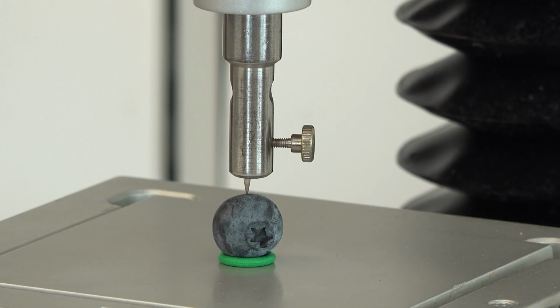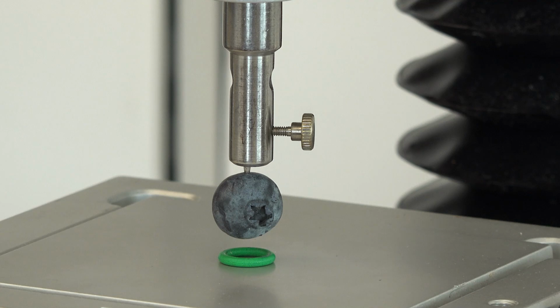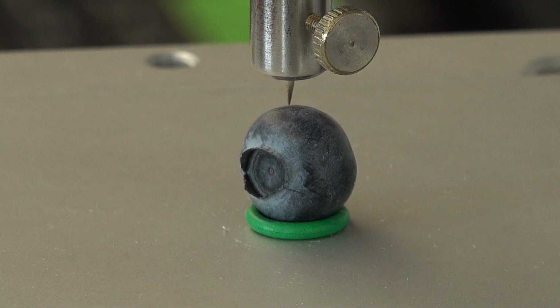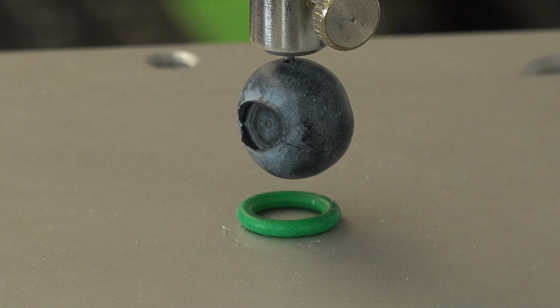And from this method, you can get parameters like hardness or resilience. We've also been using a needle probe, which has a very sharp tip. It's only penetrating the berry by 2mm, and we're trying to measure the texture components at the very outer layers, like the skin.